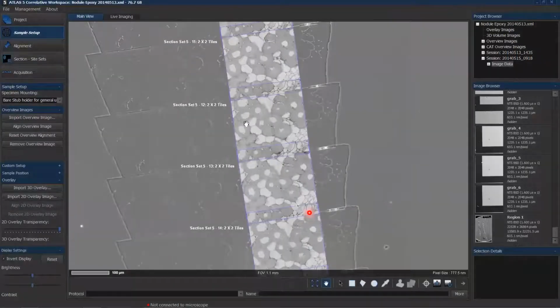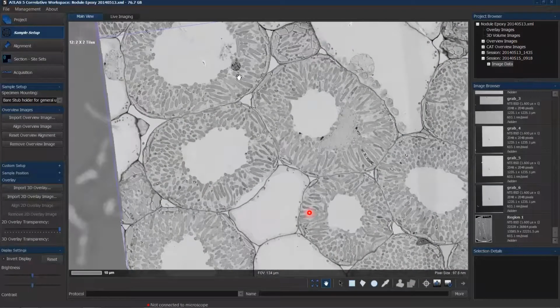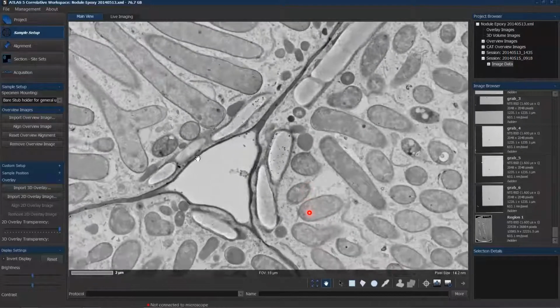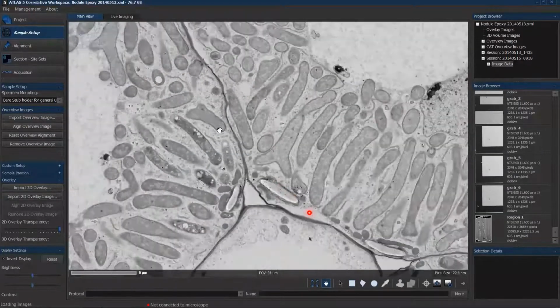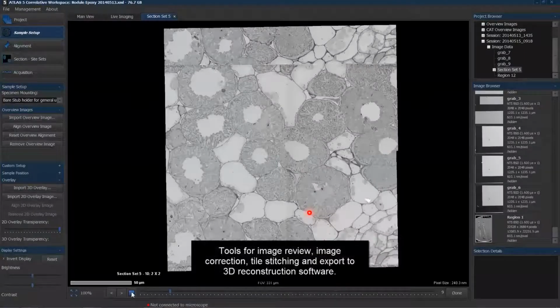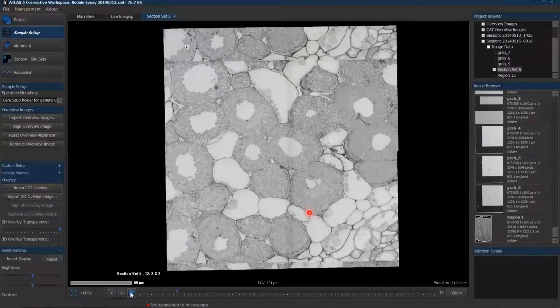In the last step, you eventually have your high resolution data, and then you can observe in that interface whether the data is usable the way it appears, or if you have to re-image at a higher resolution, or something went wrong or interrupted your workflow. You can re-image the same section to have it in pristine data quality.